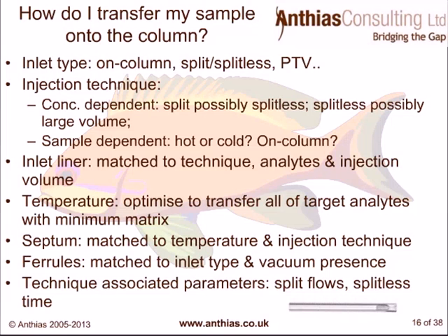Sample dependent, hot or cold or on column. How dirty is our matrix? Clean injections only for on column generally, and thermally labile analytes. Once we've then selected these, we select our inlet liner to match the technique, the analytes, and the injection volume.